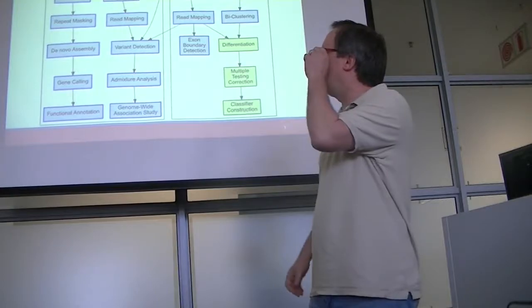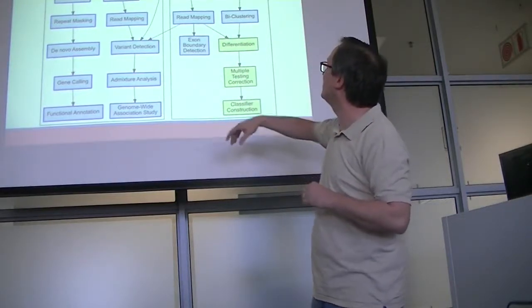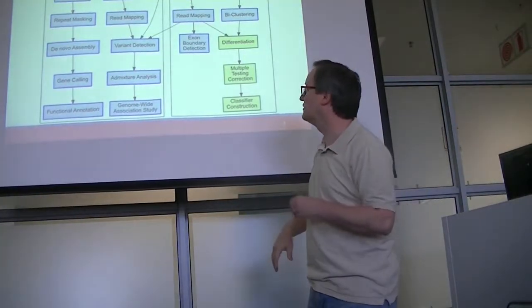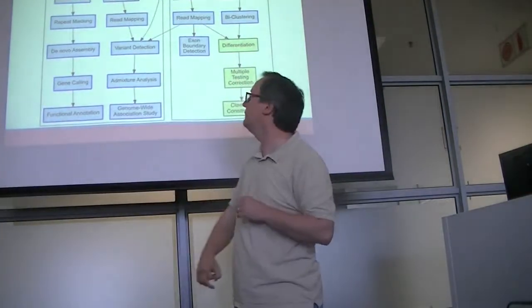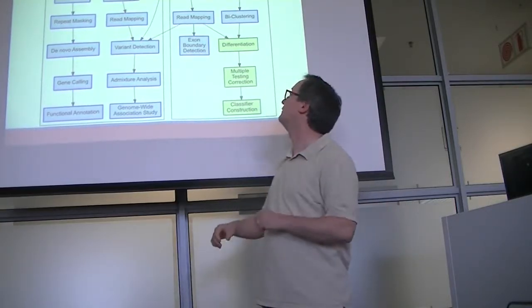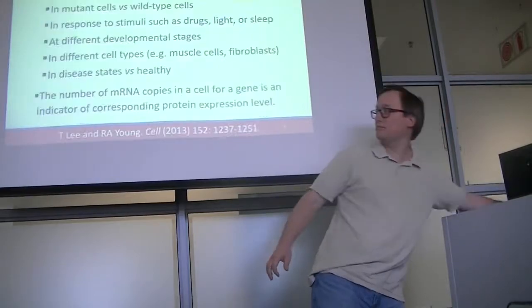Okay. Now, I remind you that all of what we've been talking about in these 3 lectures fits somewhere on this chart, really. So we're going to work our way down this green fork at the right as we talk about this material. But you remember our discussion of assembly and annotation. That was the first day. We had amplicon sequencing, which doesn't actually feel represented on this slide just yet. I need to probably update that in further years. But today we're going to be talking about what we can accomplish through RNA Seq and transcript microarrays.